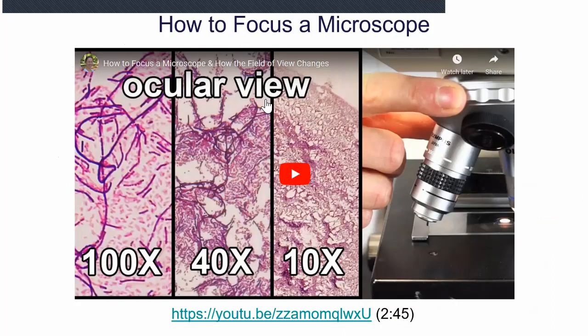So I just want to talk a little bit about, I kind of meant to show this before our first lab, but I'll play this for you now. This is just talking about using a light microscope, and talks a little bit about the different objective lenses. So I'll play that for you right now. It's a pretty short video.